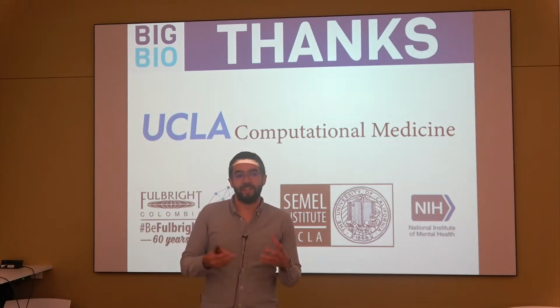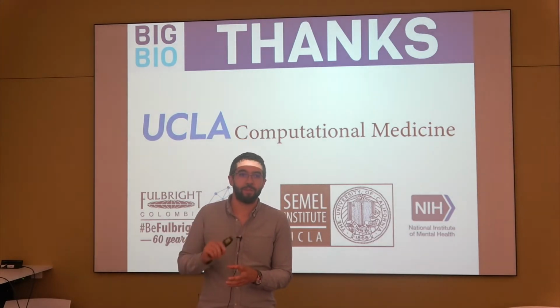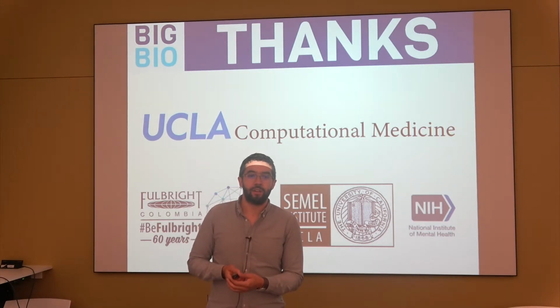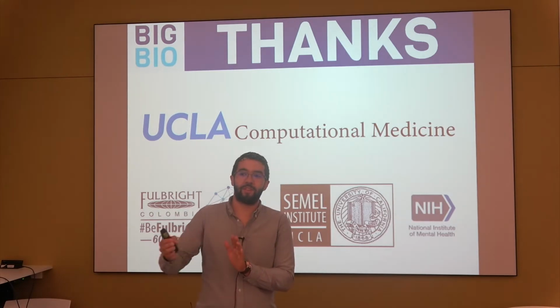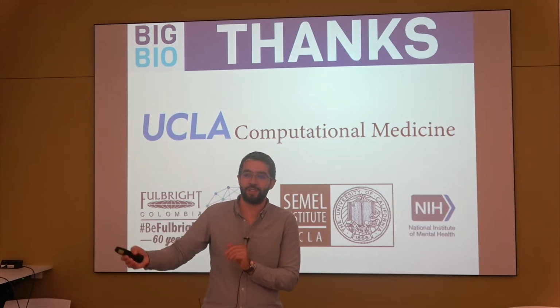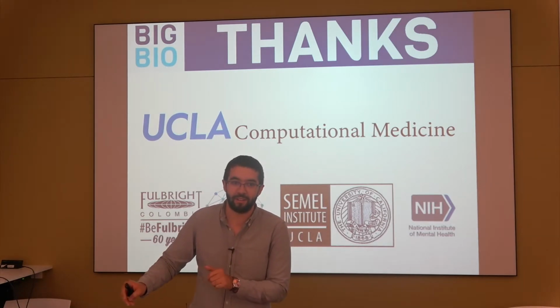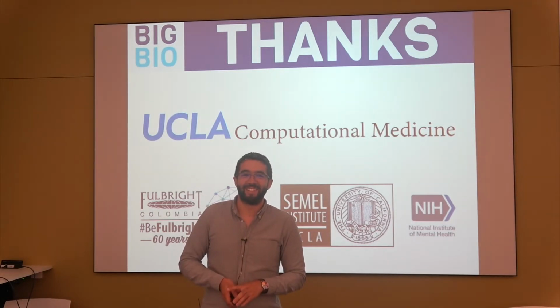Yeah, it's the intensity of the fluorescence, the color that it's observing, and the quality of the segmentation. The farther you go in the sequencing process, the lower that quality gets. But the exact process for how they do it is a company secret.